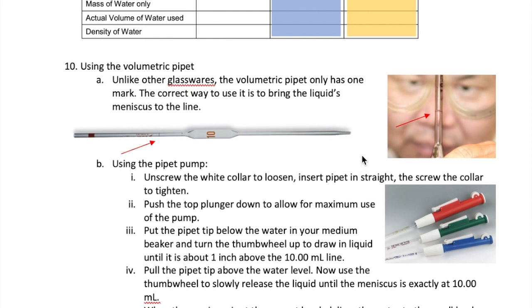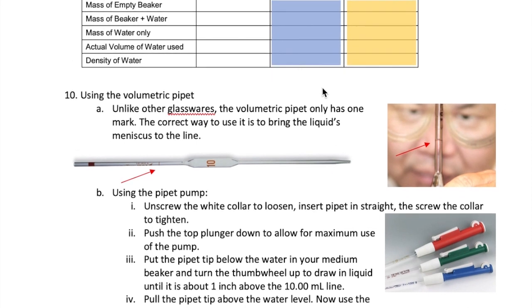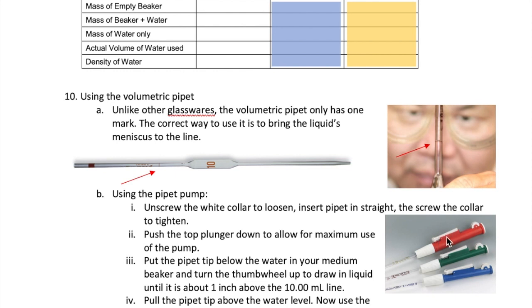Submerge the tip of your pipette into the water sample in the medium-sized beaker. Start turning the thumb wheel — this part of the pipette pump — upward, and you will see liquid slowly rising into the pipette. Keep doing this until the liquid is about an inch above that mark. Then move the pipette tip out of the water and turn the thumb wheel down until the liquid's meniscus is exactly at the mark. At this point you have 10 milliliters in your pipette. Move the pipette tip into your small beaker and press the fast-release lever, which will allow all the liquid inside the pipette to empty out into the beaker.